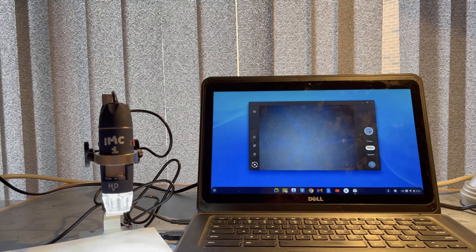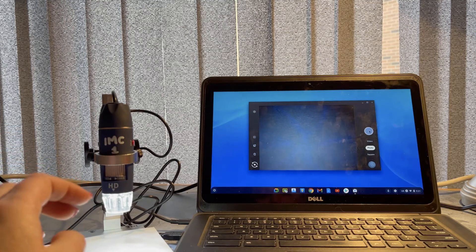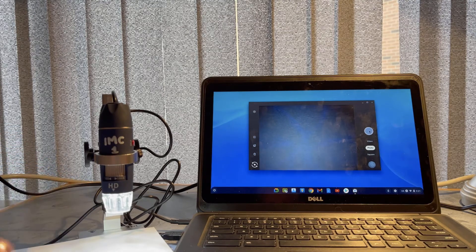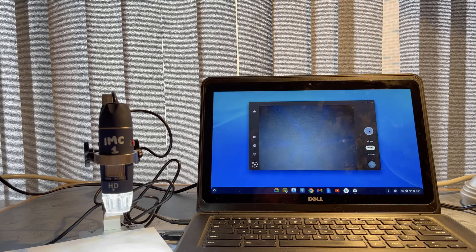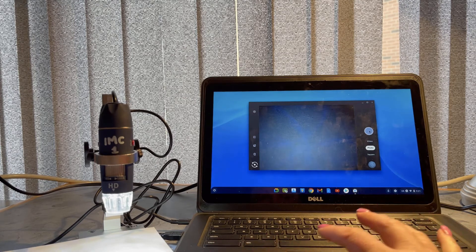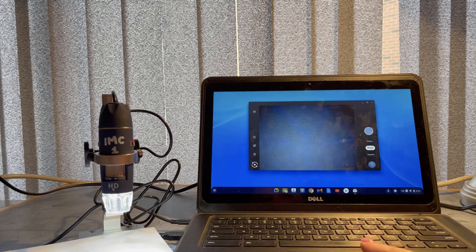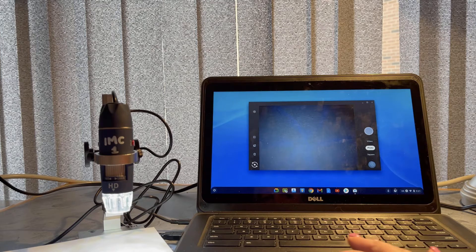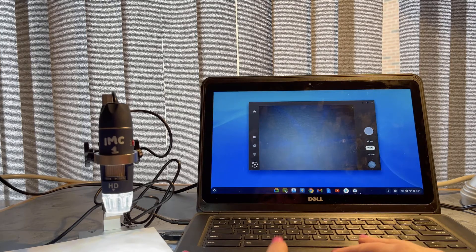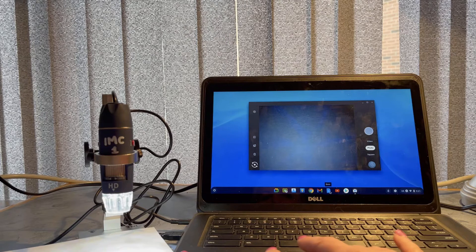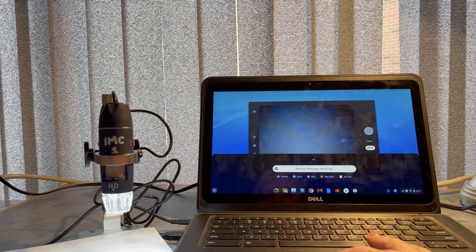So quick and easy - that's how you connect your microscope. Now if you're looking for the pictures it's taken, we'll go into our icons down here. This time I want to go into my files.